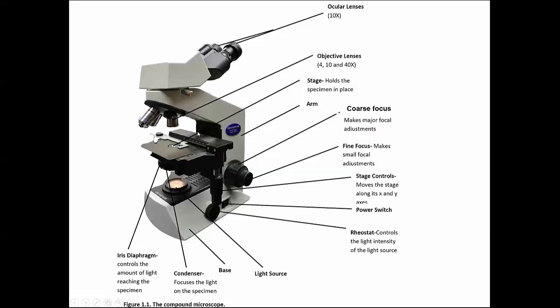The stage is where you place the microscope slide. You clip it into this silver clip that's on the stage. Then you can move the stage around using the stage controls. You have a coarse and fine focus knob. Here you have a light source and you'll have a rheostat. Even if your scope model differs from the one shown, the parts are all basically the same. The rheostat controls light intensity.